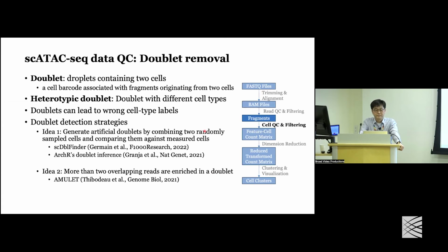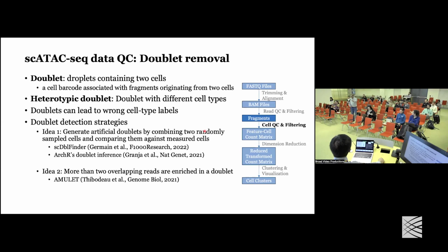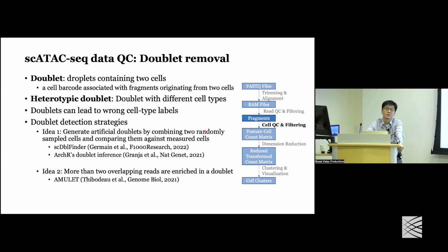All right. So you mentioned chimeric reads. If you look at the alignment and see a high chimeric rate, could that be an indication that you have doublets, or an indication that something else is happening, where you are seeing high mapping to two different regions? We never looked at it in that way, but I suspect that chimeric reads are unlikely to be produced by doublets because it's essentially the same genome, right? So, okay, that's an interesting question.